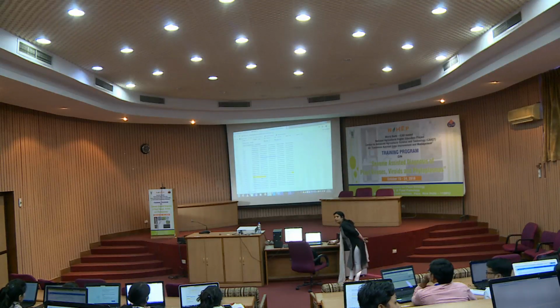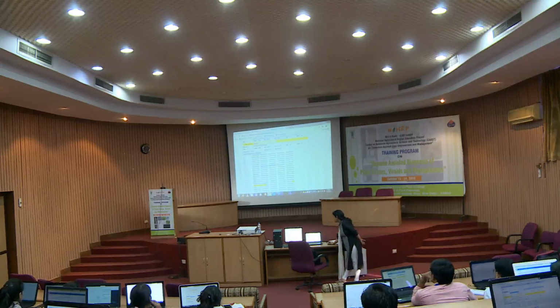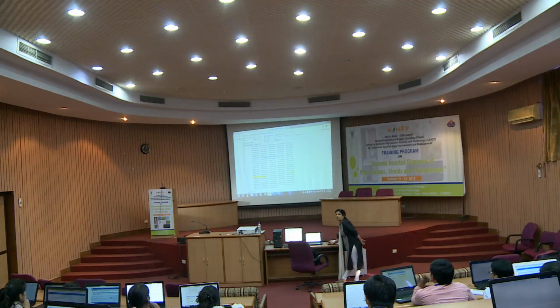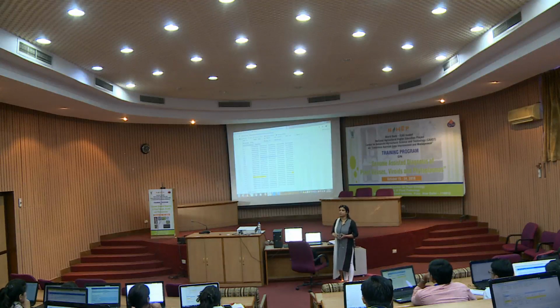Suppose I entered around 900 to 1000 bases, with one primer at this location and another at this location, then this must be the internal primer. So you can decide the location of the sequence at which to design one more primer.